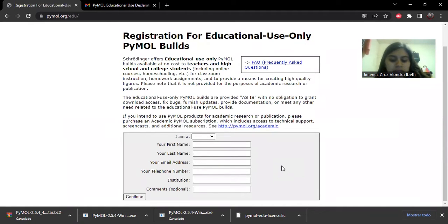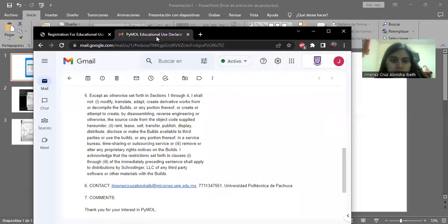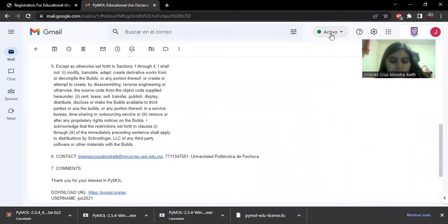It is important that we register as students for educational purposes. It is free of charge.